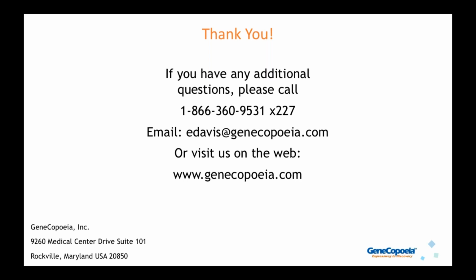Okay, so next question. What is the targeting efficiency or off-targeting effect when comparing shRNA or Cas9? That's a good question. I don't have any hard numbers for that. I believe Cas9 is actually better at off-targeting, especially when you use the higher fidelity mutants, because the off-targeting efficiency of the higher fidelity variants is actually near background levels. So those are definitely much lower than most shRNA experiments. But again, I don't have the hard numbers on me.